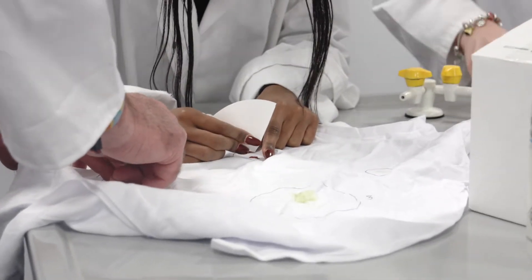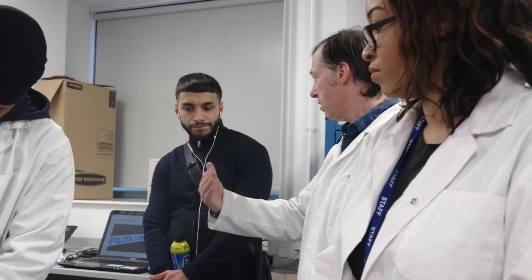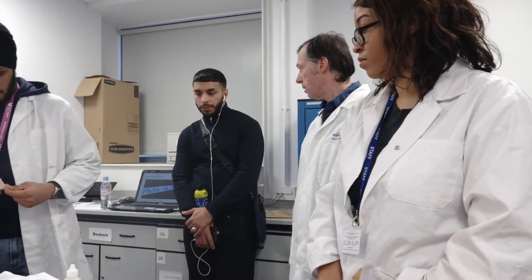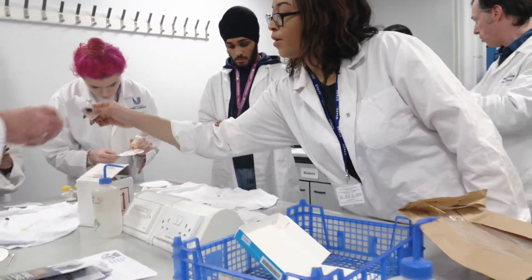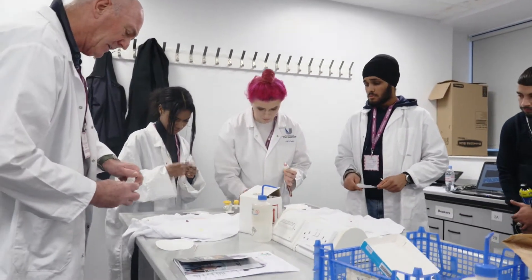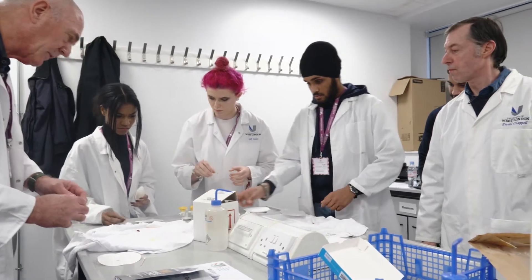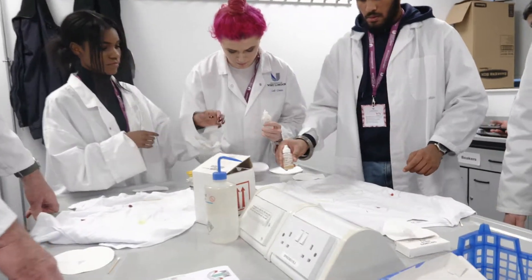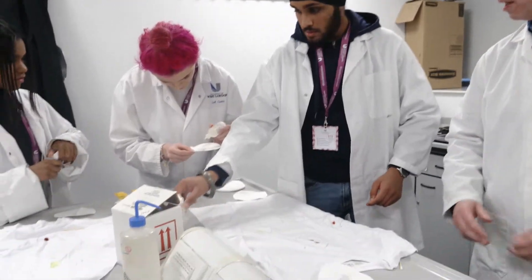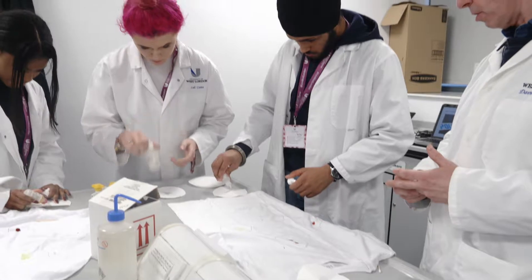You know how you have three solutions — do you have to separate them or do them together? You do them all together, because one is reacting with the next. So the first one starts the reaction. It's an ongoing reaction, so they're all coming together — the three solutions — to get a red colour. The alcohol first releases the red blood cells from the blood, if there are any red blood cells there.